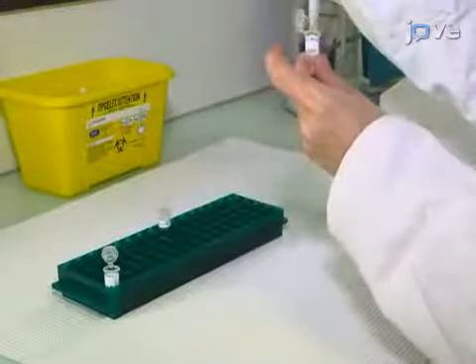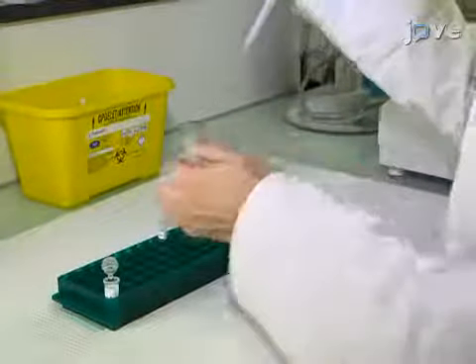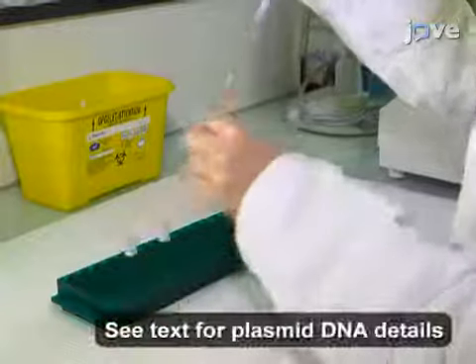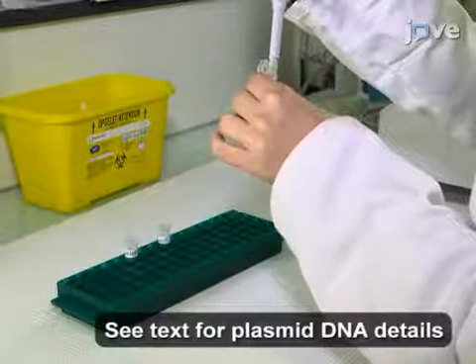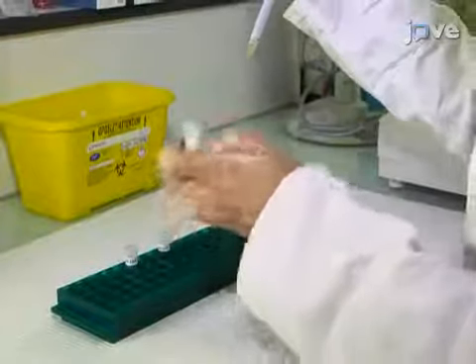To begin, gently mix 50 microliters of competent BL21DE3 cells with 100 nanograms of plasmid DNA, forming 10 to 50 million colonies per microgram of plasmid DNA in a 1.5 milliliter plastic tube.